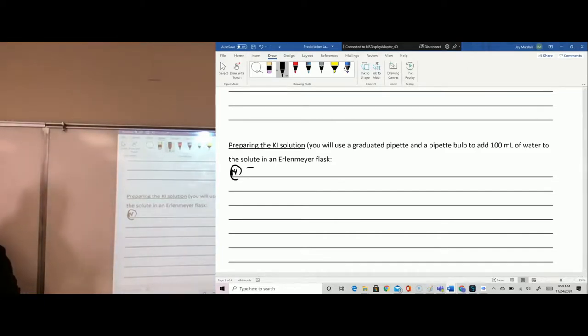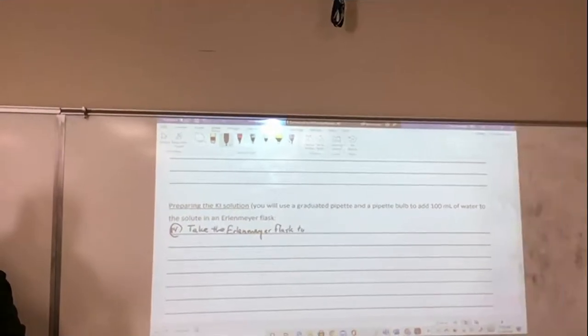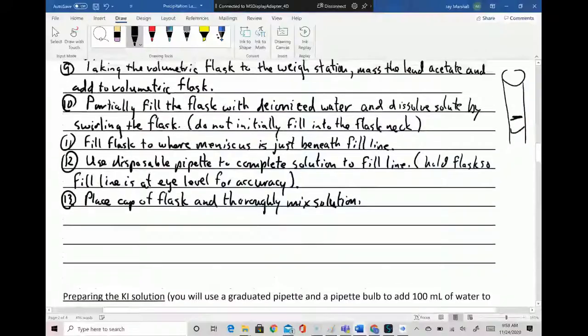Do you want to say it a little differently, or take the Erlenmeyer flask to the weigh station, and what do we say?